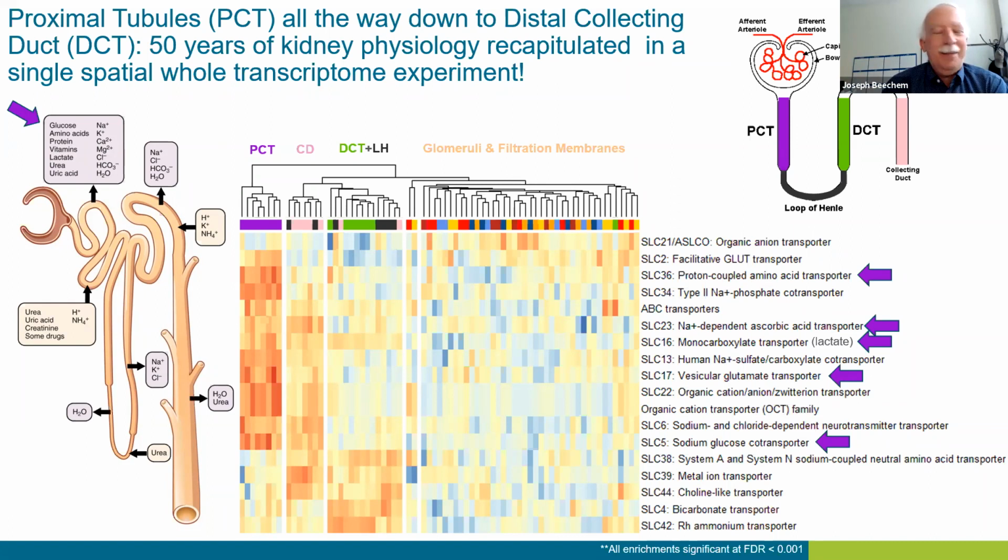And what you see, and I've been amazed at this, to be honest with you, is that you can just plot the heat map of all the pathways in your whole transcriptome, okay? And then look at the region of that little heat map, say the proximal convoluted tubules there.